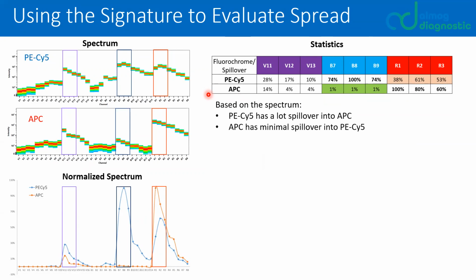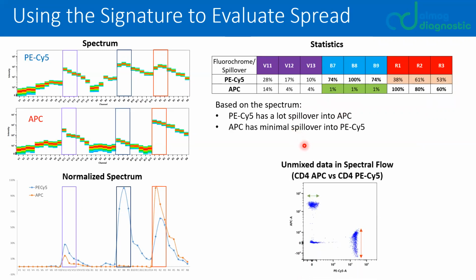This tells us first that if we're using a conventional flow cytometer, we still need to run compensation between these two dyes. Although you are detecting them on different lasers, the spillover still has to be compensated when using conventional flow. Of course, when we're running them on a spectral flow cytometer, we have the unmixing algorithm that also resolves this for us.